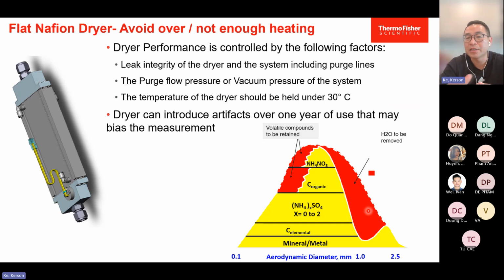But moisture for us is fine, it won't cause us a health issue. But the number for the monitoring network is very bad, because if the PM2.5 concentration is high, the public will know, and people like you and me will feel the government is doing nothing. So we need to ensure the data reflects the real PM2.5 concentration. So the main topic is how we remove the moisture.